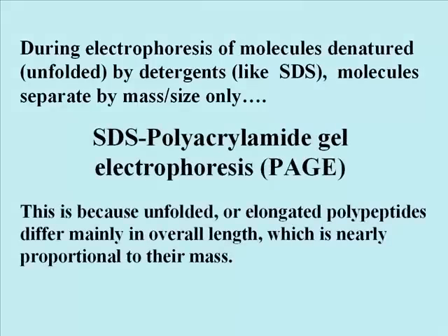Large-scale SDS-PAGE can be used to separate proteins, but in the end, the proteins remain denatured and may not refold into a biologically active molecule. Nevertheless, SDS-PAGE is a valuable tool for assessing the masses of polypeptides. And because quaternary structure is often based on weak interactions, it's also useful for analyzing whether an isolated protein, a protein you think is pure, is a single polypeptide or made up of two or more polypeptides.